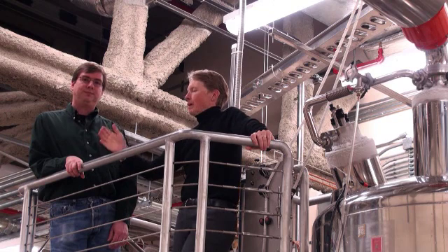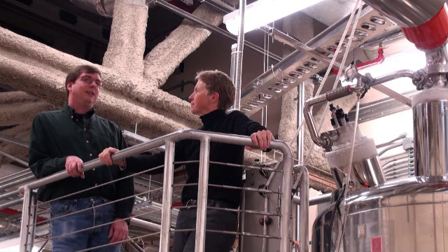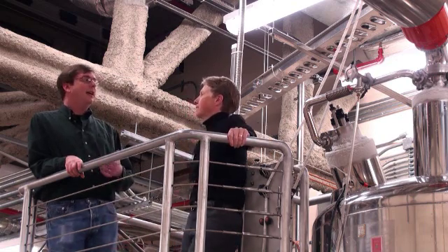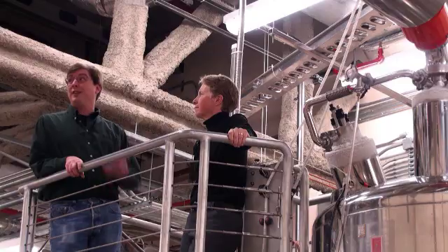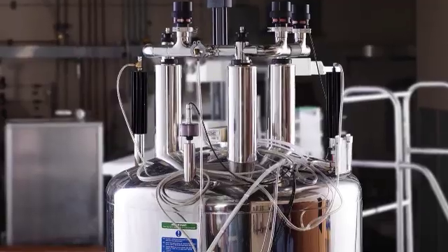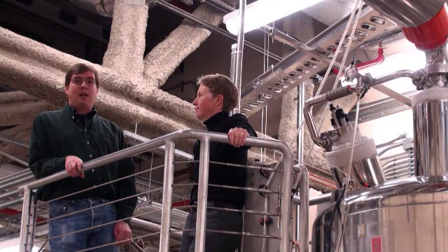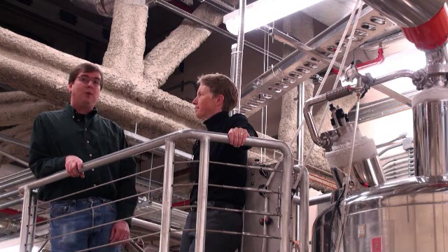Great. So what attracted you to the Wiley Fellowship and to EMSL in general? Well, I thought that EMSL really had a unique set of equipment and expertise that I thought could be very valuable for furthering my own career, as well as providing new techniques to study protein structure and function on membranes. We're here in the NMR Center at EMSL, which was a big draw for me, where we have a lot of state-of-the-art high-field NMR instruments that we can use to study proteins and protein structure. I was interested in learning solid-state NMR spectroscopy, which is a big capability here at EMSL, and so I thought that was well worth pursuing.